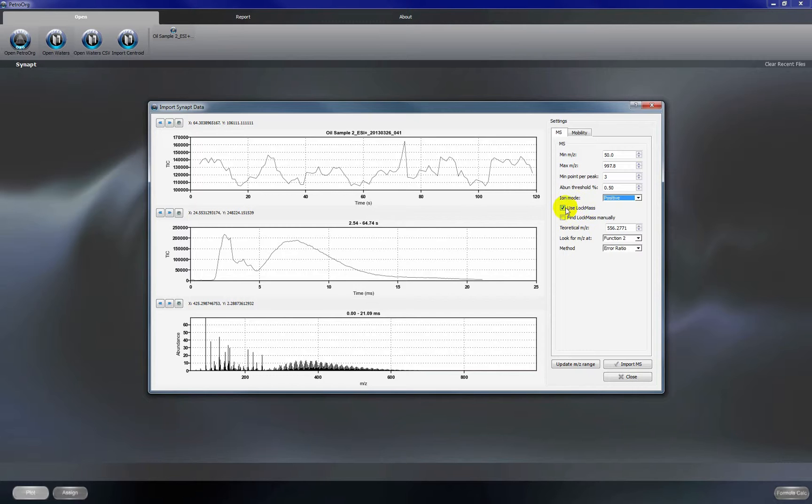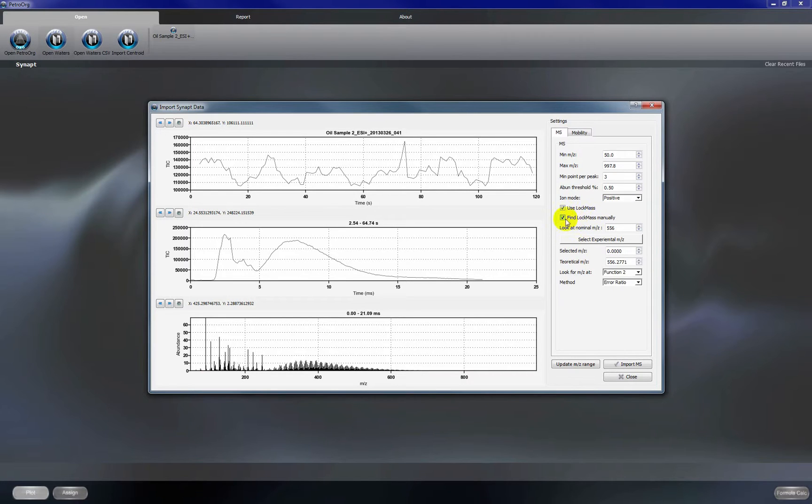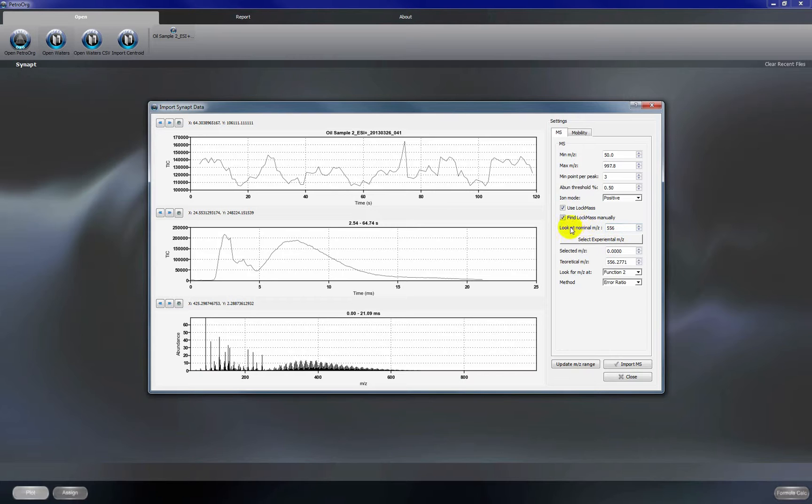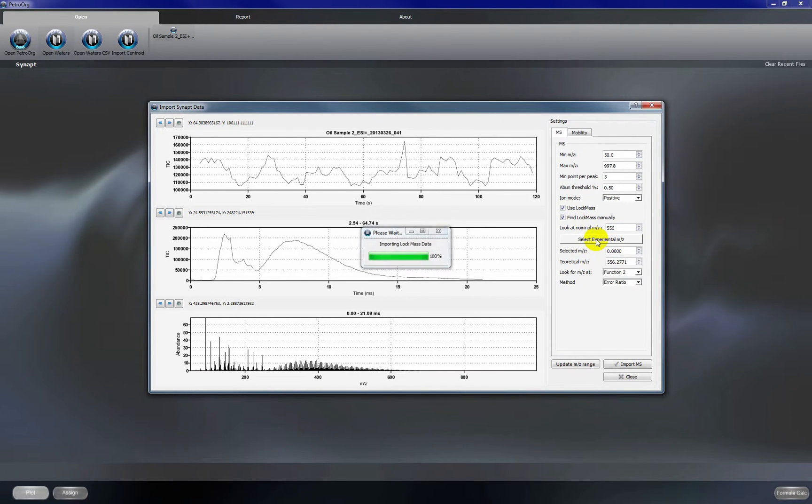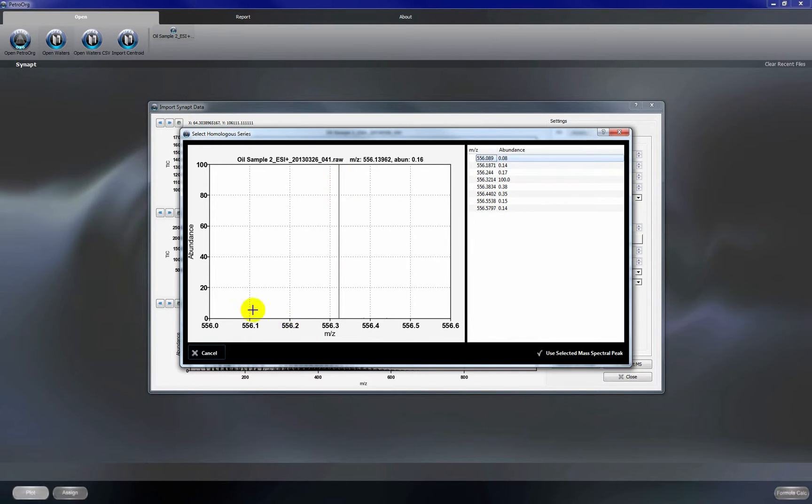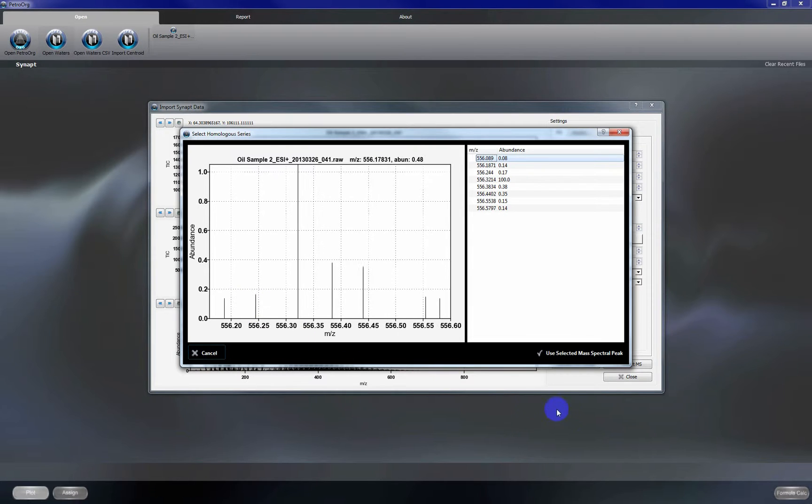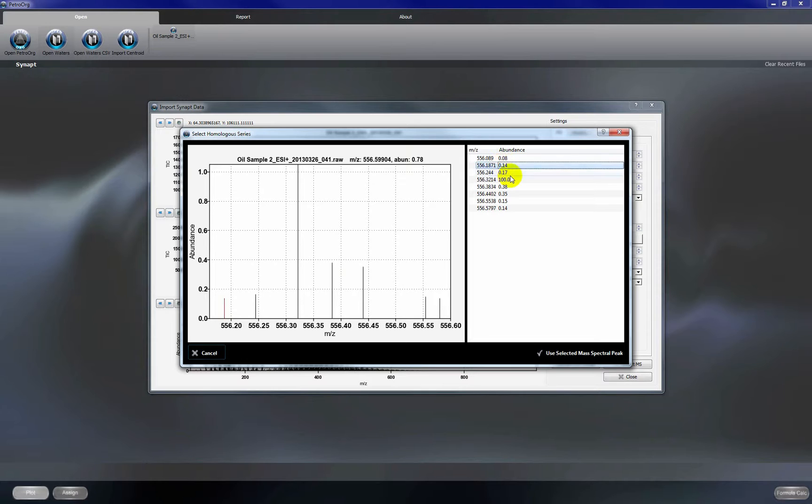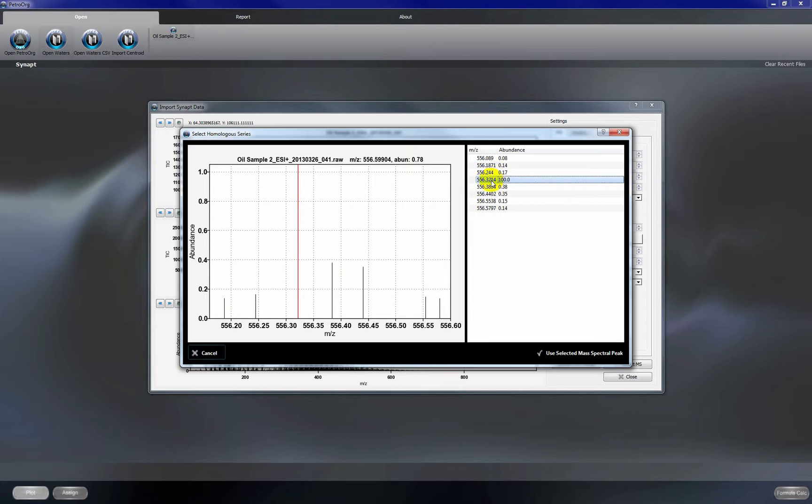We are using lock mass to calibrate and so we're going to click use lock mass and we're going to also select find lock mass manually. So what this is going to do is look at the peaks at our lock mass M over Z which is 556. We'll click select experimental M over Z and you can see here that this is the most abundant peak at that mass range but if we zoom in we see other peaks present as well.